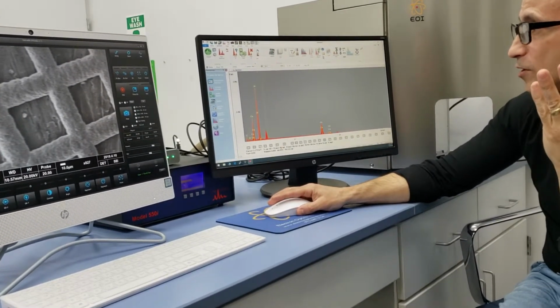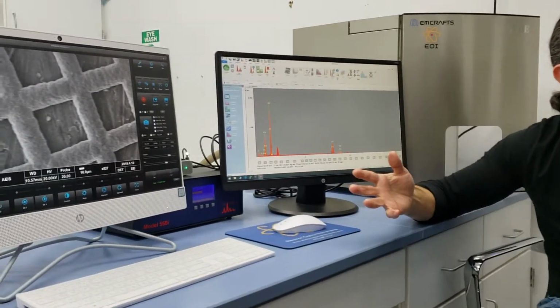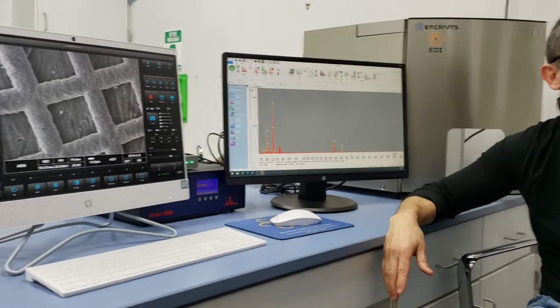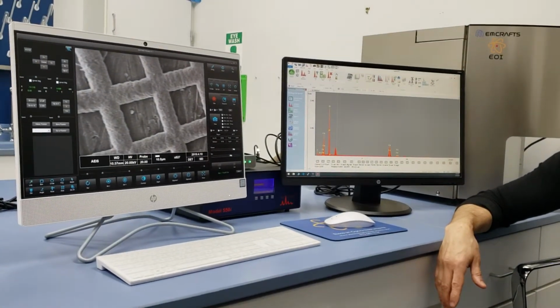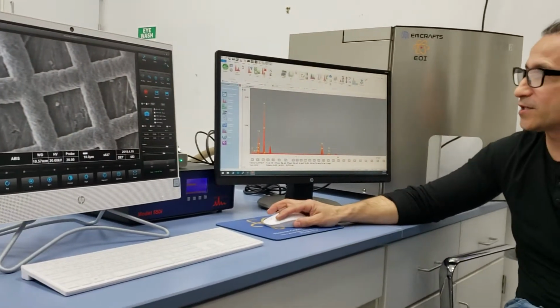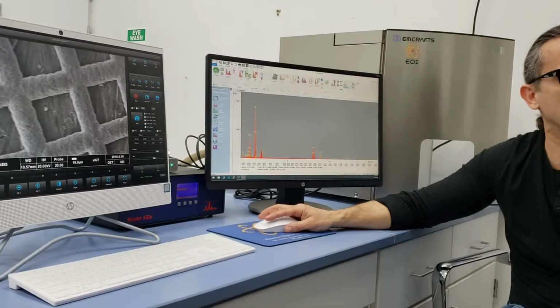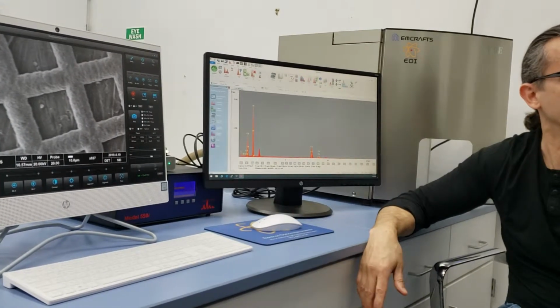Now, keep in mind, I only acquired for 14 seconds, so auto ID didn't do a great job because I only acquired for 14 seconds. It may have needed 30 seconds or 60 seconds or 100 seconds. Also increase the preset time. I stopped the acquisition, right? So I would have just let it acquire longer. I was just impatient.